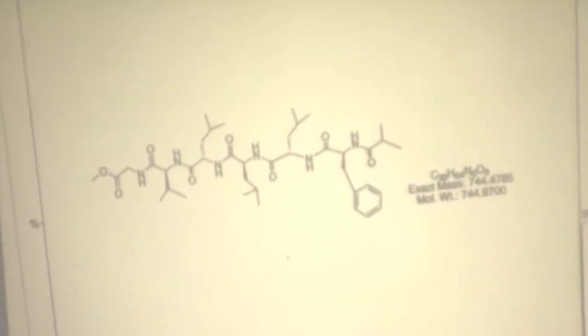All right, and we're going to be talking more about actual mass spectra in subsequent times. Everyone have a handout? All right, so this is a handout of a particular molecule. This one happens to be an example of a peptide. Now we're going to talk more next time, but one of the big concepts is you're separating molecule by molecule, which means you're looking at individual isotopomers.